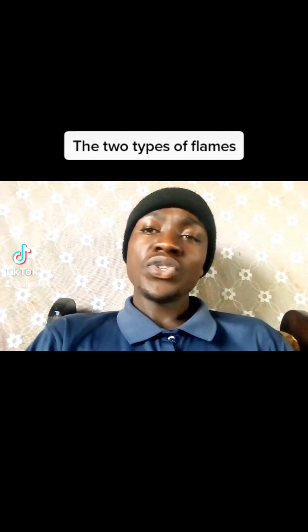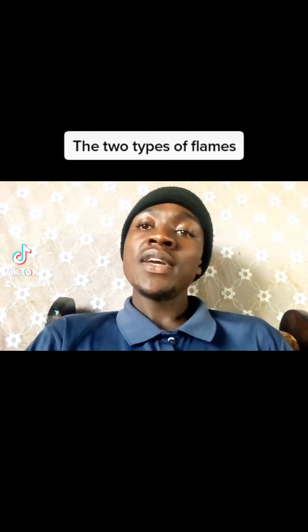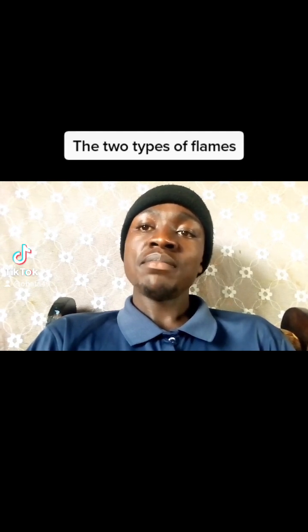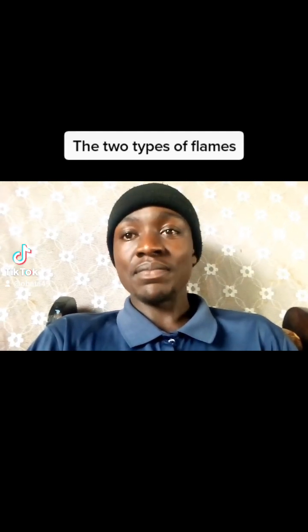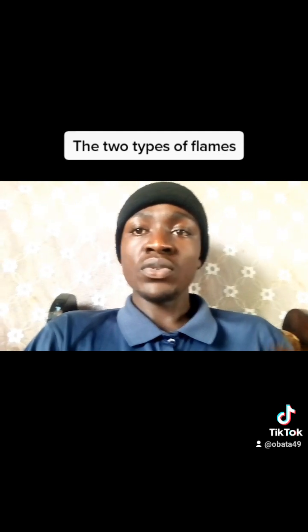Now, when you talk again about these two flames, you can get a question: why is a non-luminous flame preferred for heating? So when you get such a question, this is how you should respond. A non-luminous flame is preferred for heating because it produces a lot of heat. The second reason is that it does not produce soot.